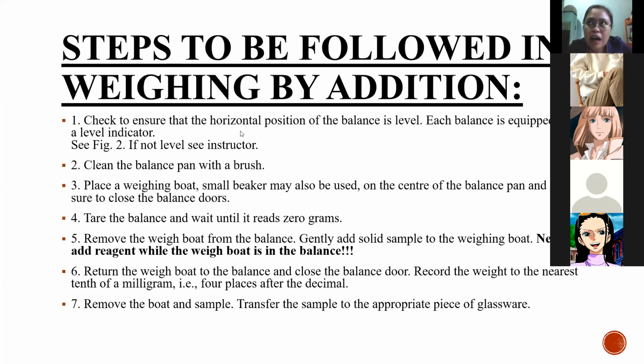And why is it not the most accurate? Remember, in that case you took out the beaker and placed it on the top load balance. So whatever is on the top load balance can add up to the weight of the container plus the sample.